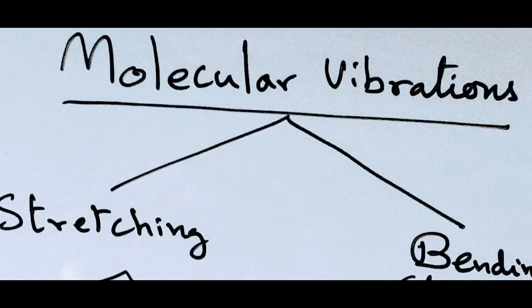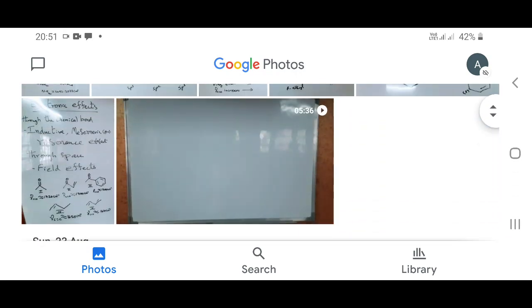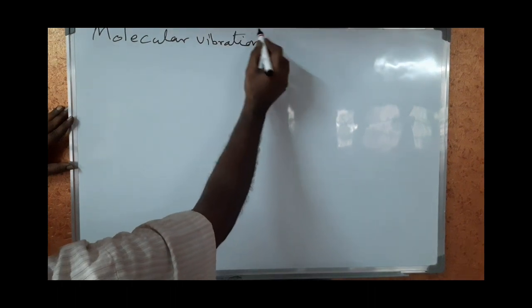So let us understand the molecular vibrations through this simple video. I have a video presentation. From this video, let us try to understand the molecular vibrations by comparing it with a metal ball attached to a spring.